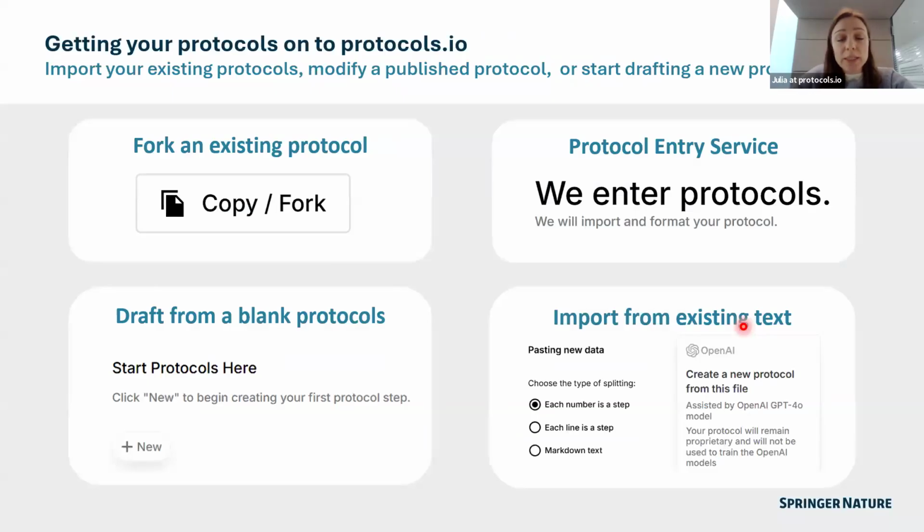This should also be somewhat familiar to you, but if it isn't already, there are multiple ways of getting your protocols onto protocols.io. So you can, of course, look at all of the published content, create a fork of that and work from that. You can create a blank protocol, and I'll show you a little bit about that today.